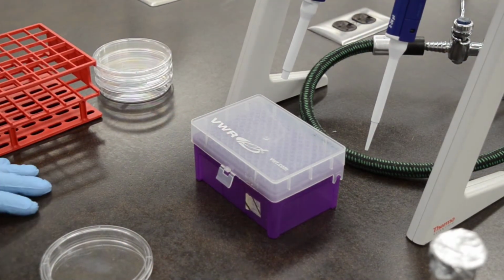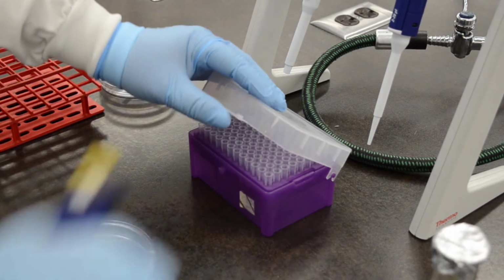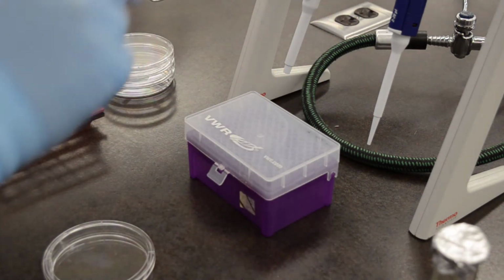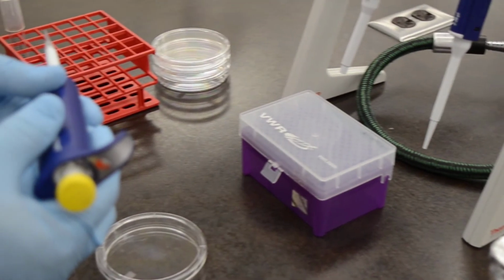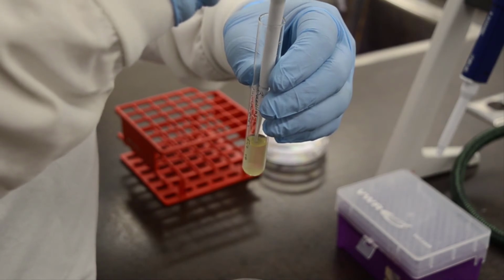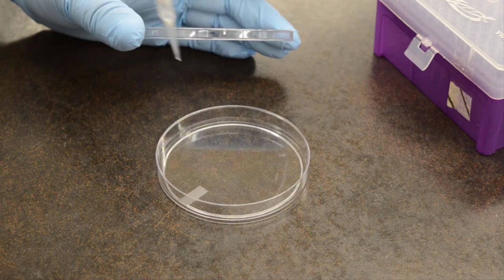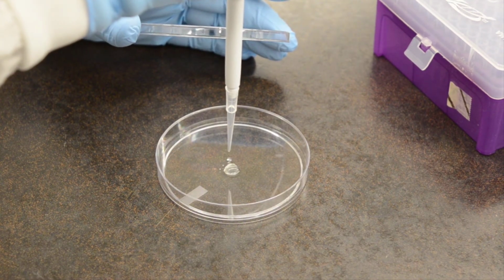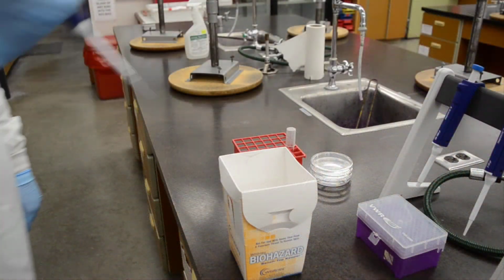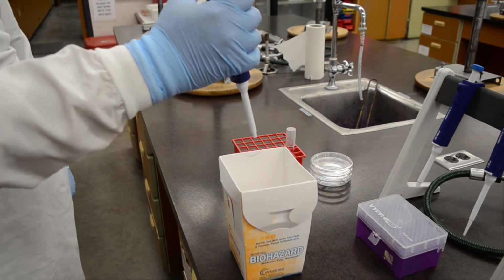Each micropipette size uses a different size disposable tip. Make sure the tip size you are using is the right one for your pipettor. It is a good idea to seat the tip firmly and correctly onto the handle by tapping it a few times to make sure that the tip does not fall off or leak air. Withdraw 100 microliters of the contaminated broth culture and then dispense that into the bottom of a sterile empty petri dish. And then dispose of the contaminated tip into an appropriate receptacle.